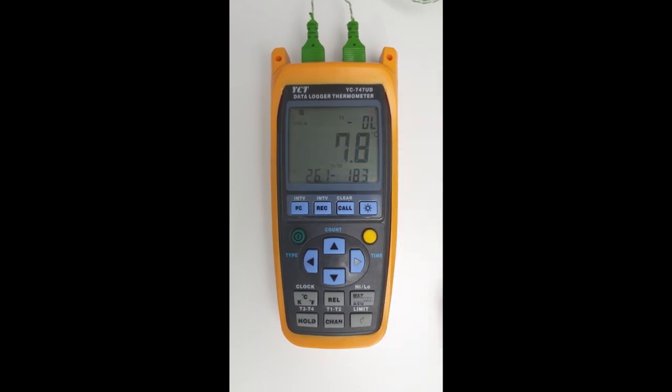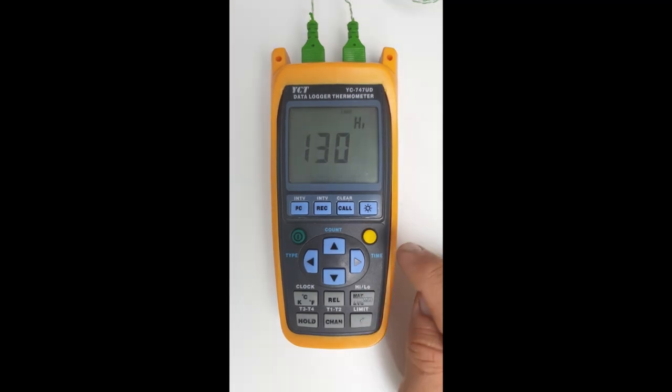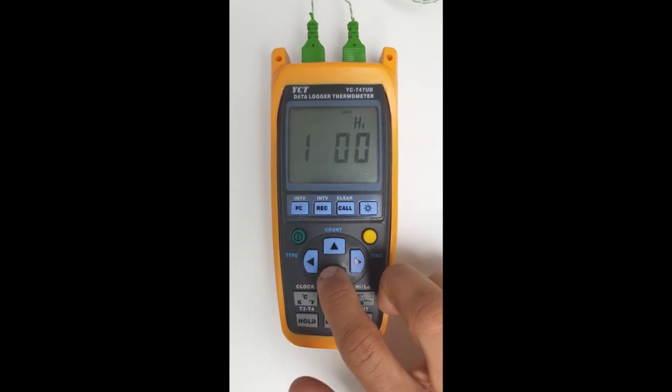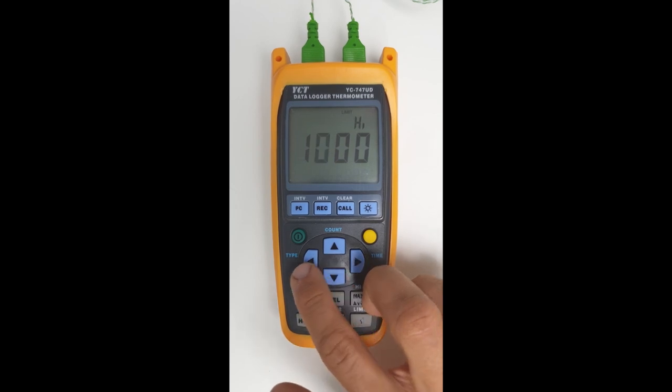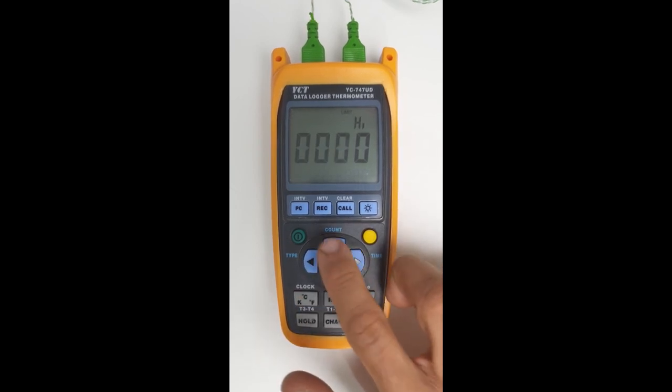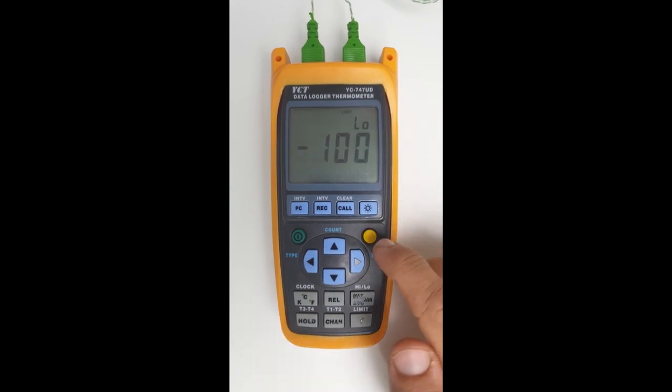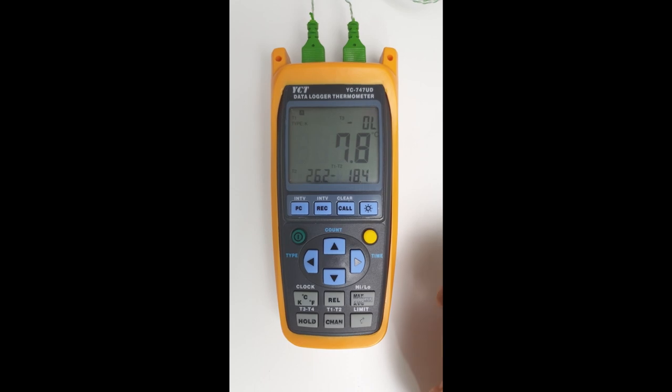The next feature we'll look at is alarming. We can set high and low limits. If we click on the shift button and then click on the button where it says high and low above it, we'll change the high limit to be 30 degrees Celsius. Click on the shift button and we'll leave the lower limit the same. Click on shift, and then to activate it we click on the shift button and then the button where it says limit above it. Now it's been activated.